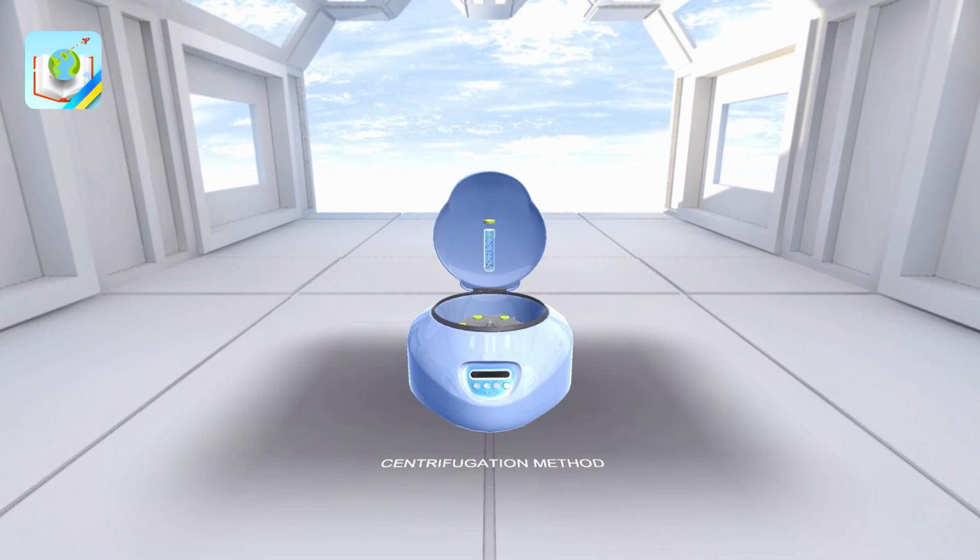So, what is centrifugation measured in? How to understand the concept of deeper and denser? Centrifugation is measured in such a value as the sedimentation coefficient. It is denoted by the letter S. The higher this coefficient, the denser the structure. Therefore, S will be at its maximum in the nucleus and at its minimum in the lightest components.